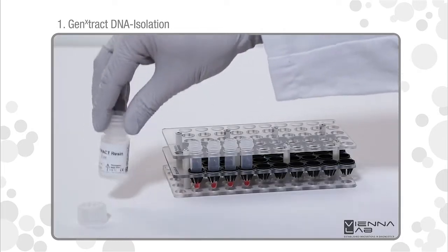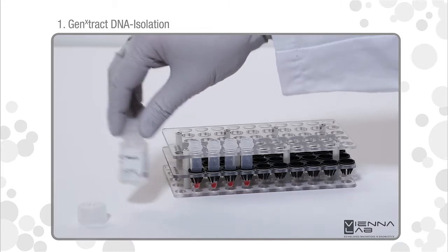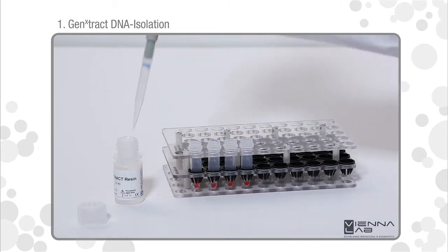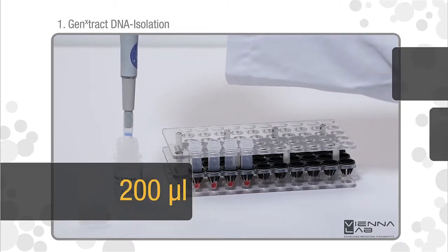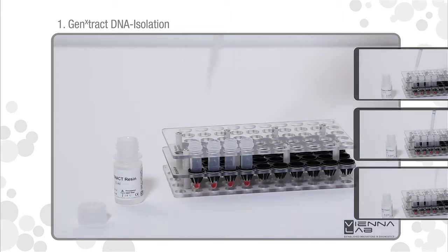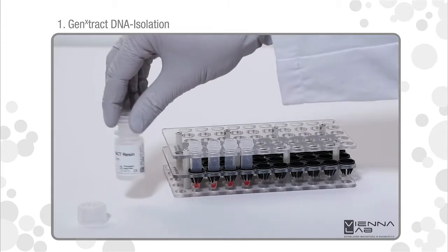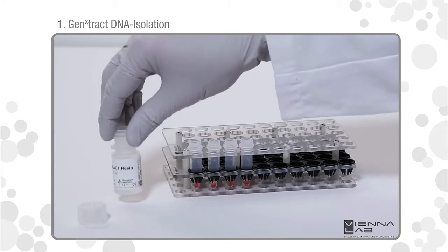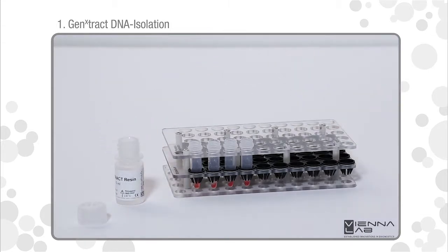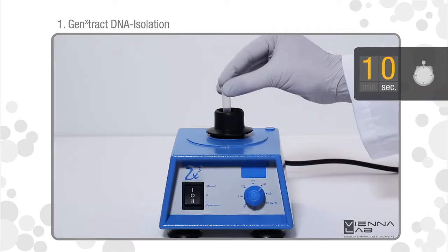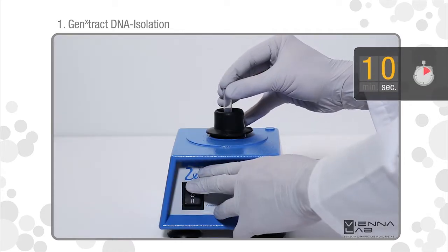Resuspend gene extract resin by swirling the bottle thoroughly. Add 200 microliters gene extract resin to the pellet. Gene extract resin sediments quickly. Repeat suspension each time immediately before removing another aliquot. Close tube and vortex for 10 seconds.